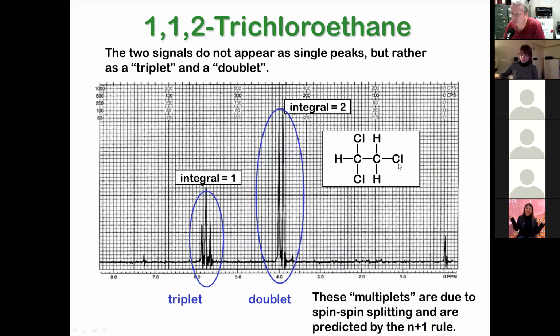All right, so this is a really ugly looking NMR of this molecule. A CH with 2 chlorines and then a CH2 with a chlorine, all right? So first question, which one of these is the downfield one? Is it going to be the left one, the CH or the CH2? It's going to be downfield, to the left.